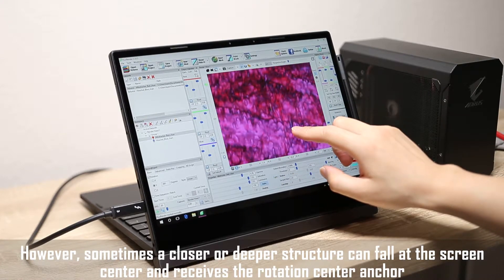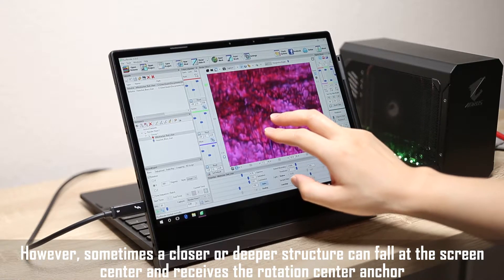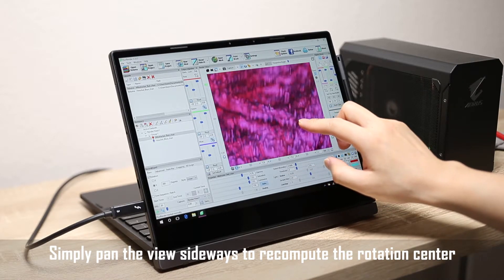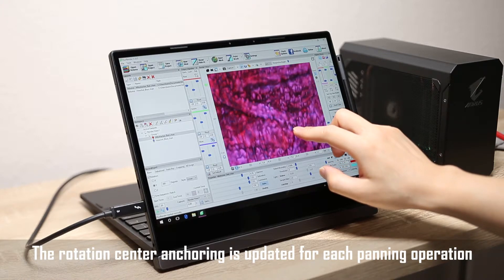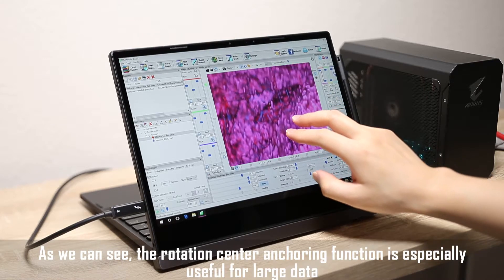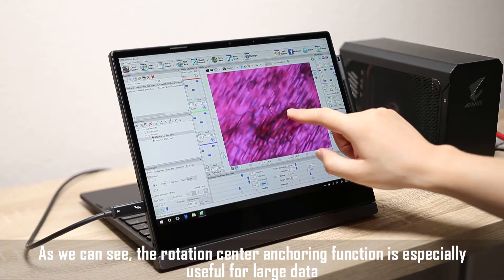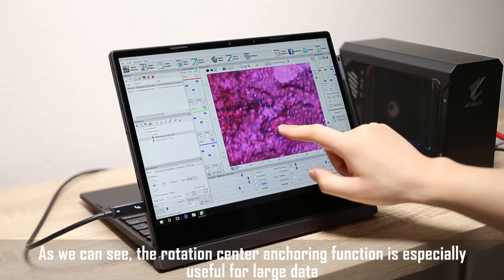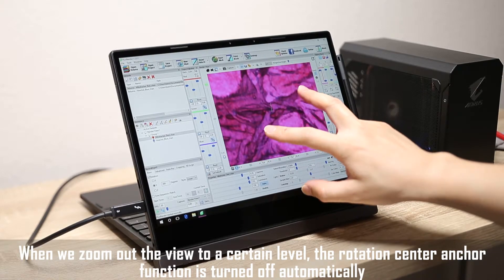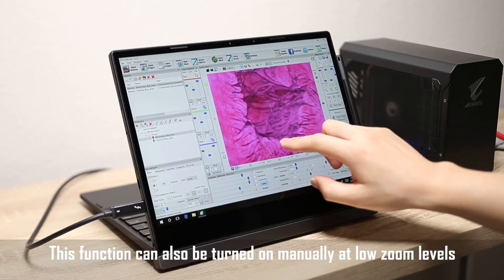However, sometimes a closer or deeper structure can fall at the screen center and receives the rotation center anchor. Simply pan the view sideways to recompute the rotation center. The rotation center anchoring is updated for each panning operation. As we can see, the rotation center anchoring function is especially useful for large data. When we zoom out the view to a certain level, the rotation center anchor function is turned off automatically. This function can also be turned on manually at low zoom levels.